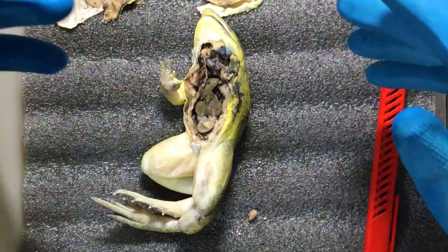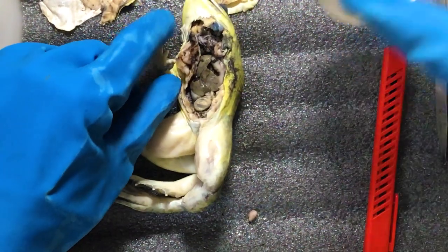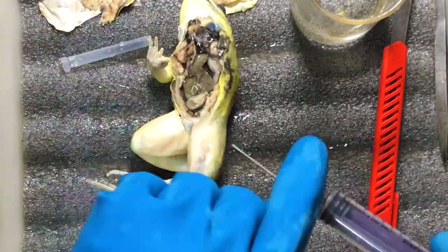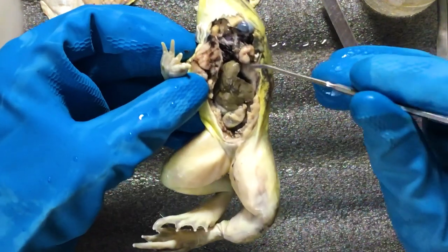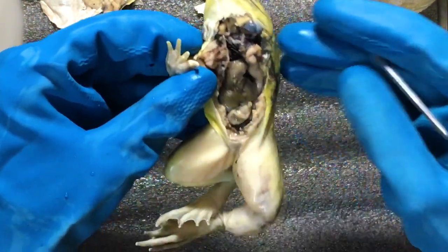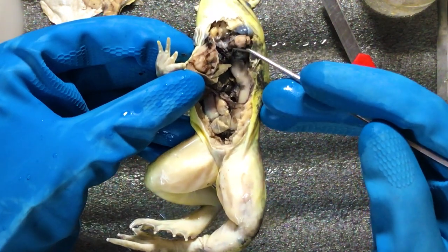The body contains lots of cellular matter and blood, so I'll clean this with simple water. Now here we can see a three-chambered heart, three pieces of liver, and here we can see the gallbladder, the pancreas, and behind there are the lungs.